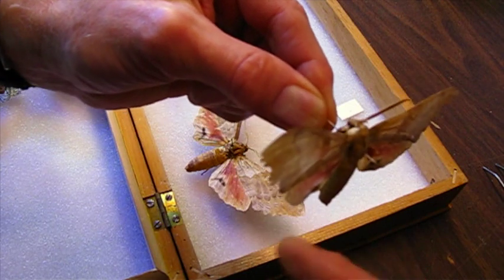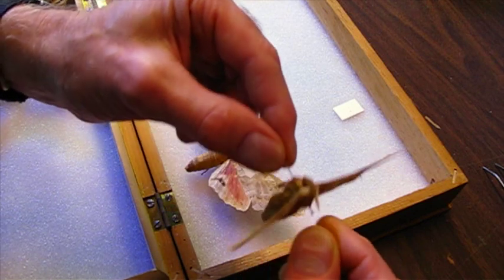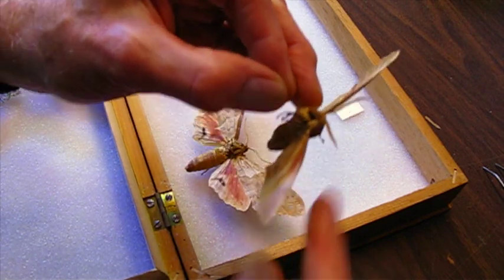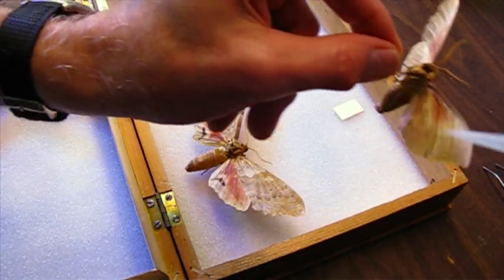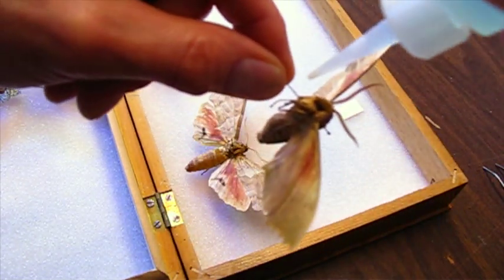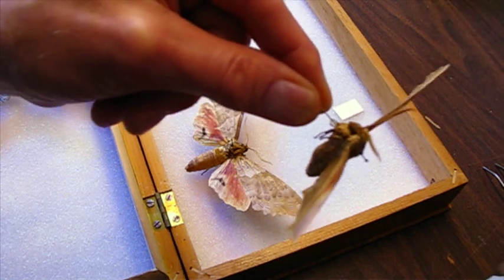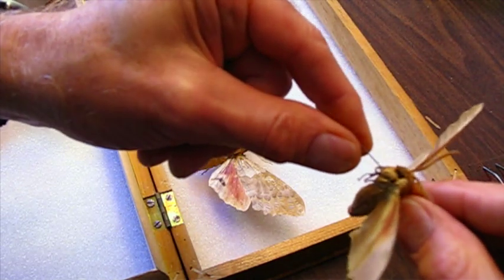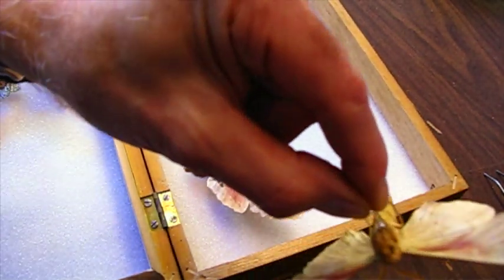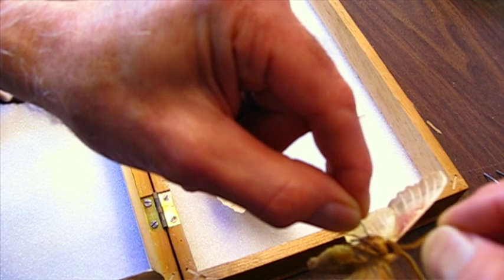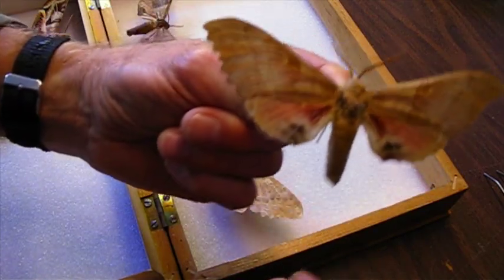Now I notice this one's spinning on the pin a little bit. There's a way to fix that too. I'm going to push the moth up towards the head of the pin. I'm going to get my glue. I use water-based gel. Put a little dot of glue on the pin just above where the body is, and then gently push that back onto the pin. Maybe just smear that glue around the edge of it a little bit. When that dries, get it in the right position here, that'll hold the moth in place.